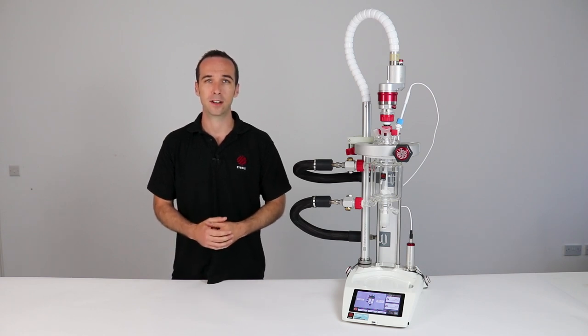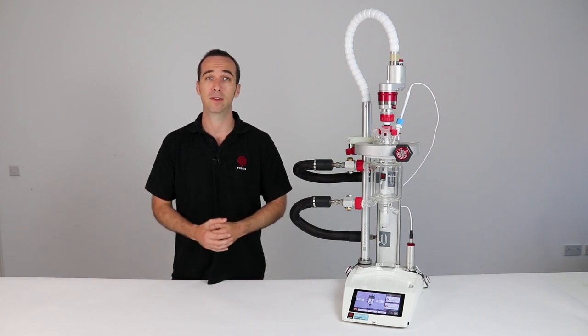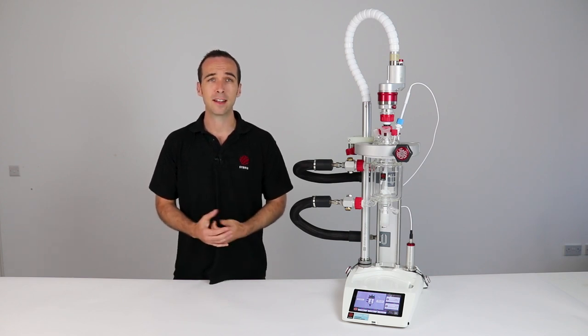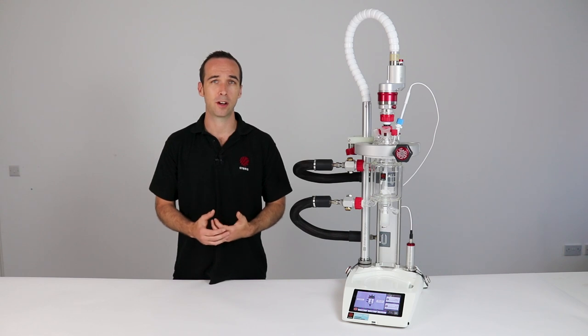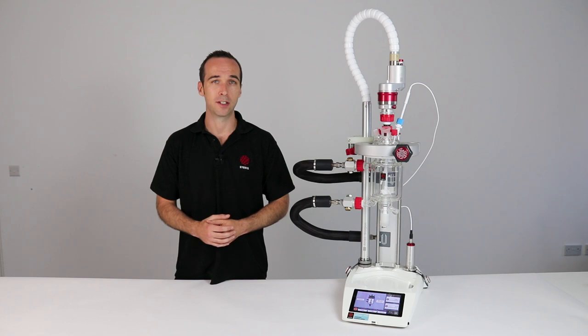When designing Atlas HD we wanted to ensure that it was as easy as possible to assemble and reconfigure to suit your needs. The Atlas HD system has recently received a major update to reaction automation and through consultations with our customers we listened, developed and implemented a number of new features such as pH control and sensor-based dosing and clear and simple experimental visualization. All these features allow automated processes to be run and monitored in a seamless and optimized manner.